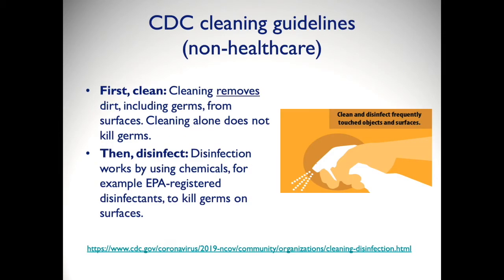Per CDC's cleaning guidelines, first, clean. Cleaning removes dirt, including germs, from surfaces. Cleaning alone does not kill germs. Then, disinfect. Disinfection works by using chemicals, for example, EPA-registered disinfectants, to kill germs on surfaces.